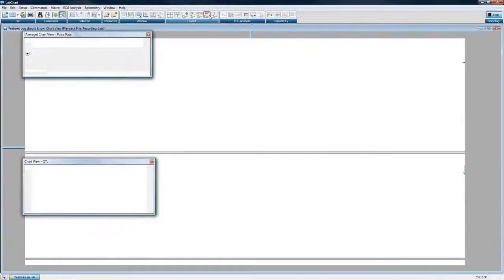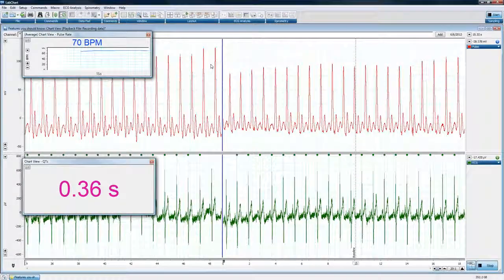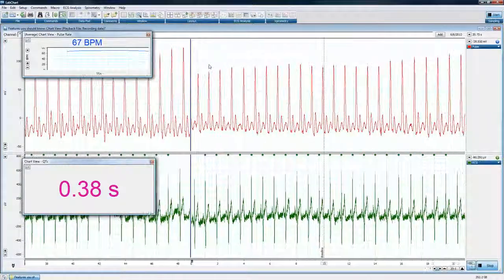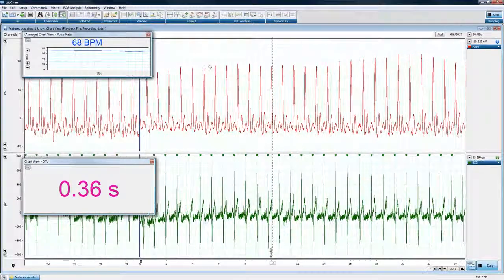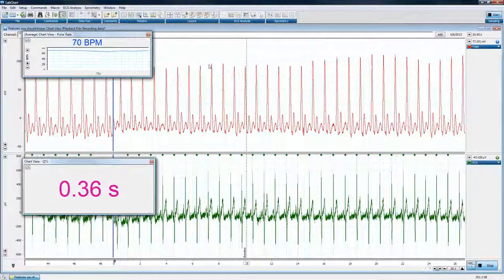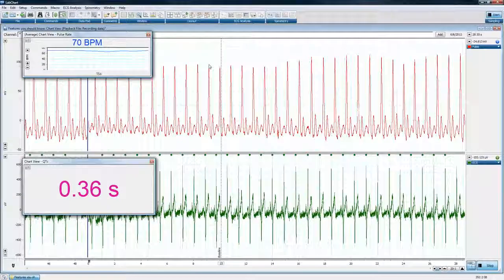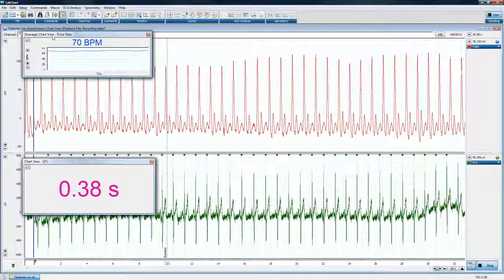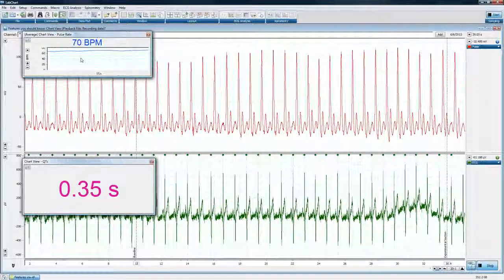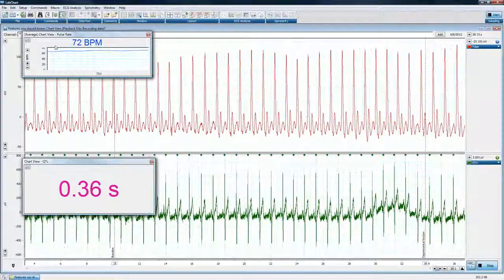This layout that we have, sorry, I'm choosing the wrong one. This layout here has the DVMs on it. One of the things you're going to notice is a new feature that we've created in LabChart 7.3, and I think actually might have been 7.3.4 in a recent release of LabChart, and that is the DVM tools or the DVM plotting tools.